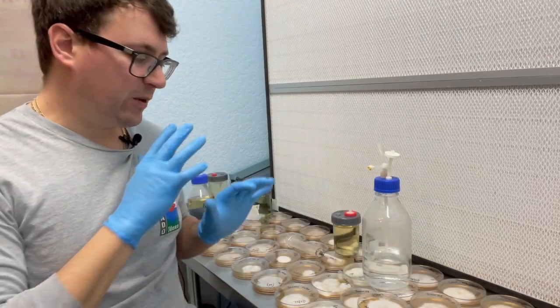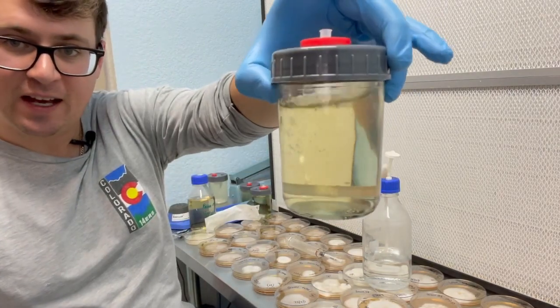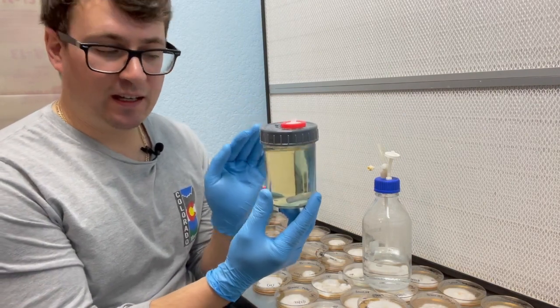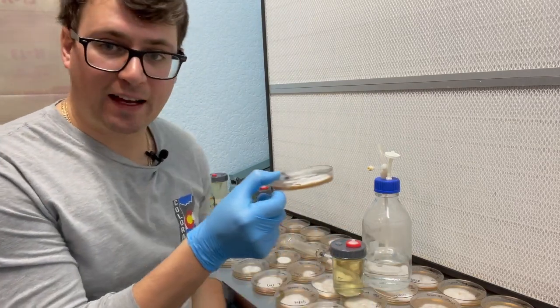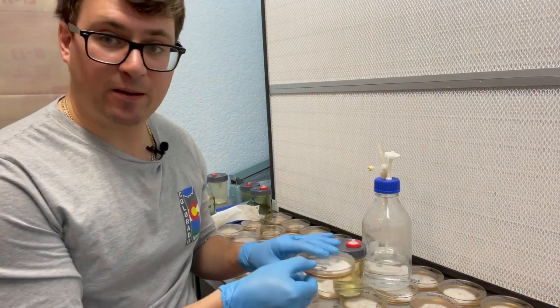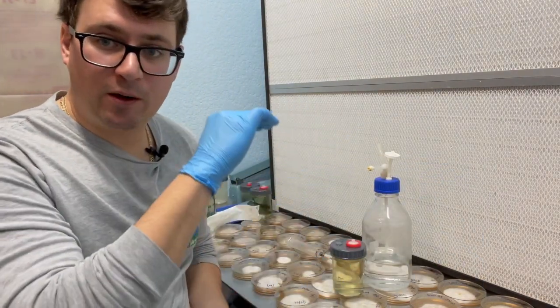I hope you enjoyed that video on how to inoculate a liquid culture. I'm going to throw this on the stir plate for a few days. Then I'll be using this liquid culture to go onto grain to test out this plate. I can go ahead and parafilm this and put it in the fridge.